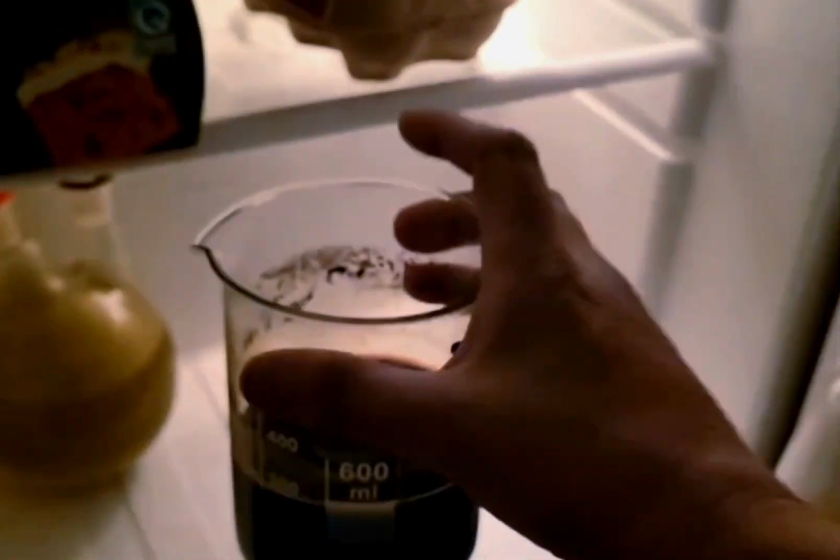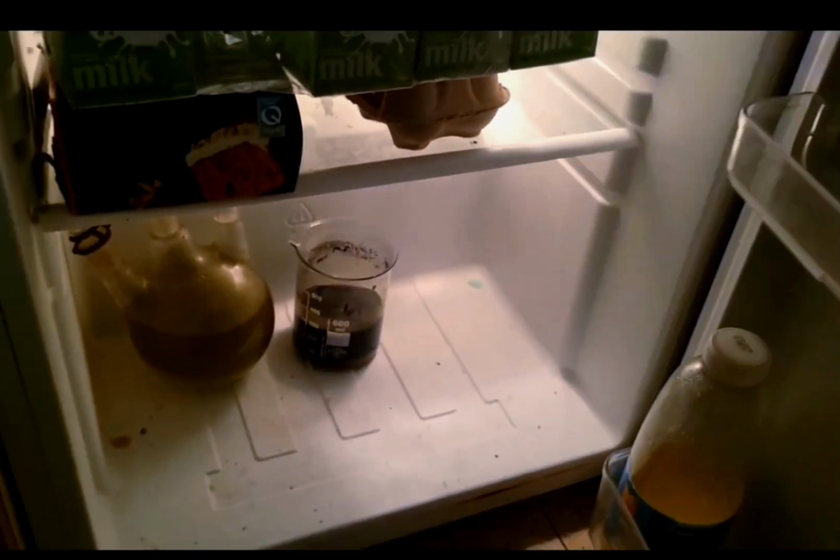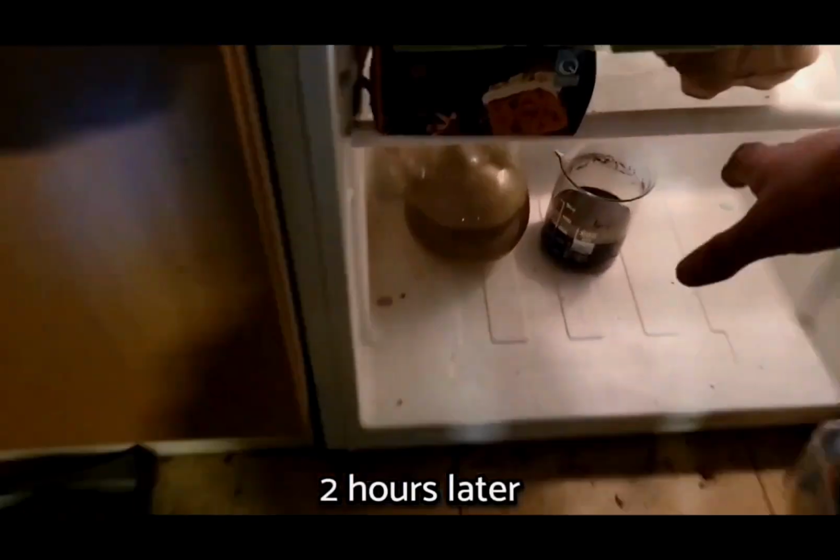We can fully crystallize this out by putting it in the fridge. Then we can filter and wash our product.